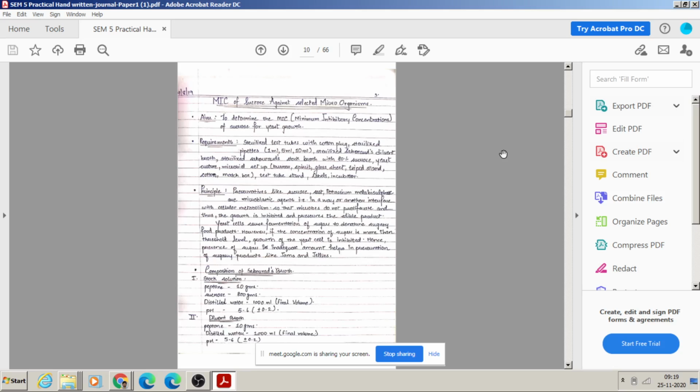After one specific concentration level, the yeast activity may get inactivated. In beverage industries or alcohol industries, the role of yeast is very important, and its nutrient input in terms of concentration should be standard. From that point of view such tests are performed, and at what concentration the yeast shows the best result is checked.